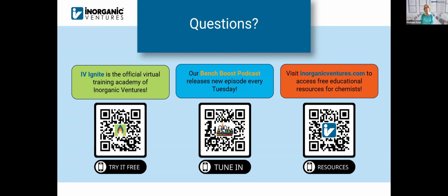Part of the preparation work for submission is getting the beta testing done and sending out the sample kits to various laboratories. That is going to give us data from these labs where they're using different instruments, where they're having to deal with their day-to-day work and see how our system compares to theirs. We're going to be using those results to help us get ready to submit this method to ASTM for approval.